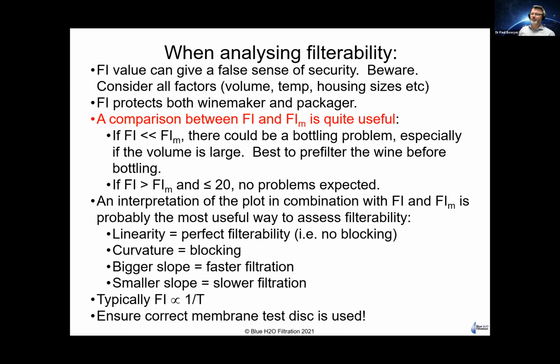But what it means is if you get a pass by doing that, then you can be 99% certain there's going to be no issues at packaging, because it's passed without the pre-filters in place. If you get a fail, it means you may have a problem, not that you necessarily will. That's when all the other factors come into play, like the temperature and the volume and the condition of filters and so on.